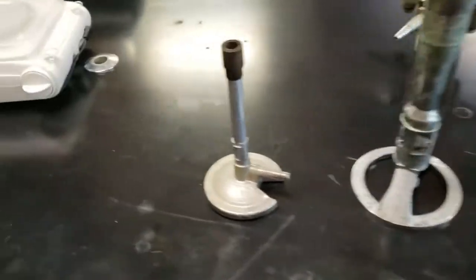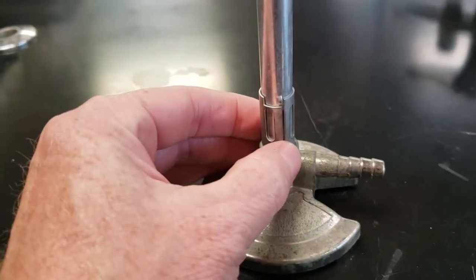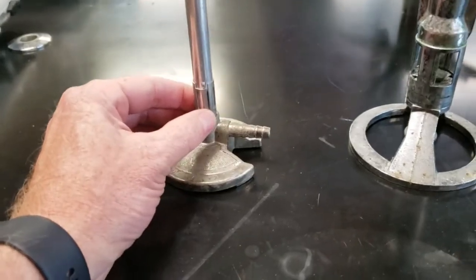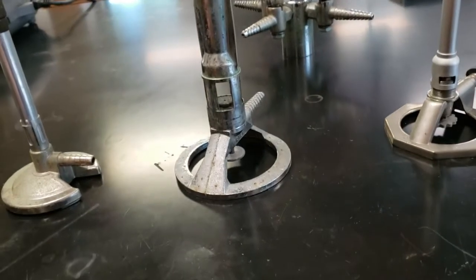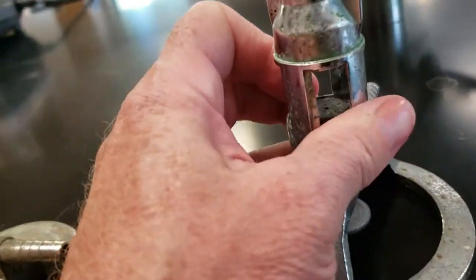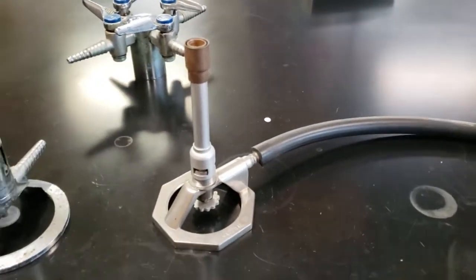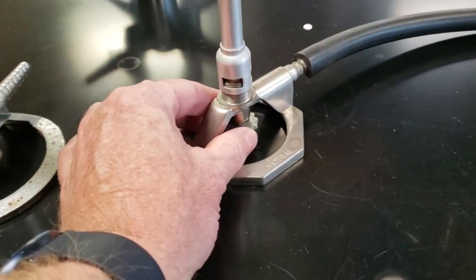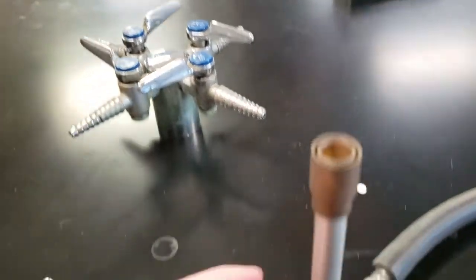Here we have three burners. This is the classic Bunsen burner. It's got a simple collar, it's super inexpensive, and with just an eighth of a turn, it goes from full open to full close. This is a Meker burner. It burns really hot with low flames, and if it wasn't so stuck, you could also open and close it there. This is like a carburetor. Here is a Tirrill burner, two R's, two L's, and here's the gas adjustment on the bottom, and you can adjust it there at the spigot.